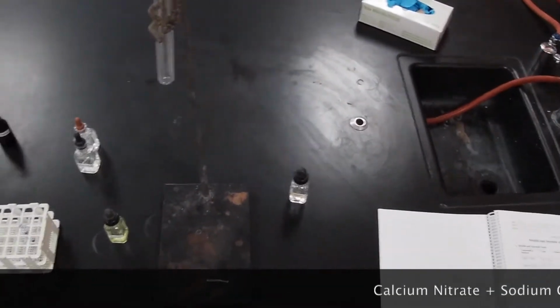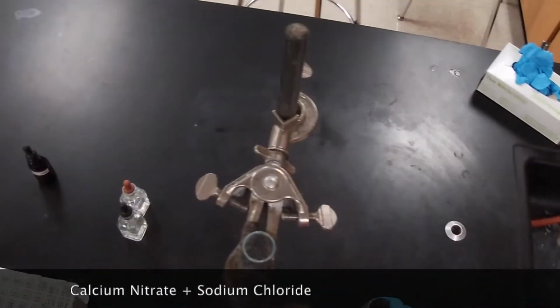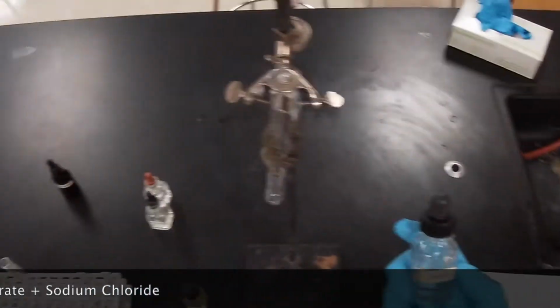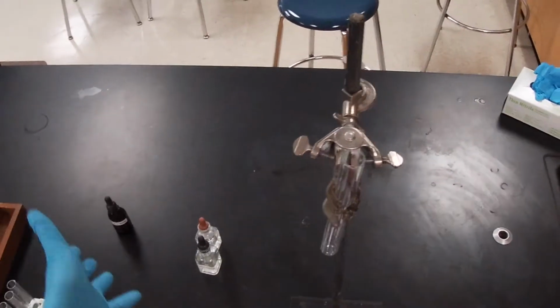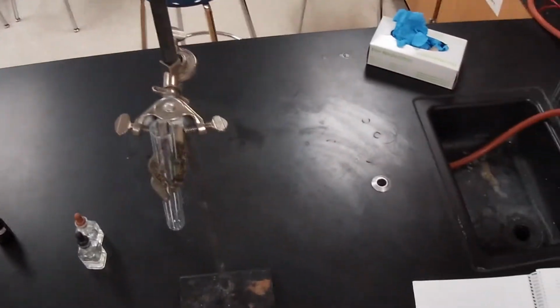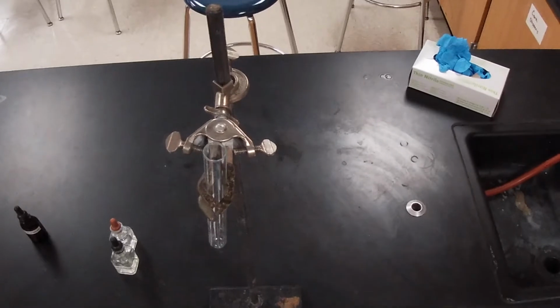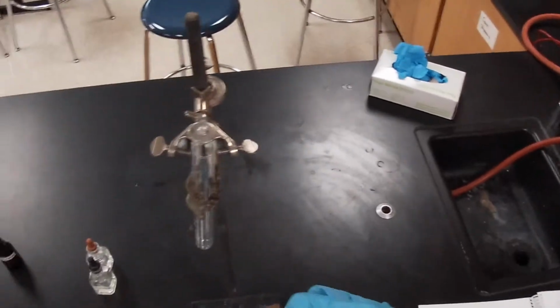Our next reaction, we're going to do calcium nitrate and react it with sodium chloride. We're going to react them with the same ones we reacted silver nitrate with. So we're going to go sodium chloride first, sodium sulfate next, and then sodium phosphate. We're going to start with calcium nitrate, 0.1 molar solution.